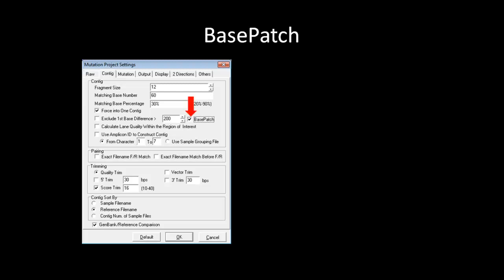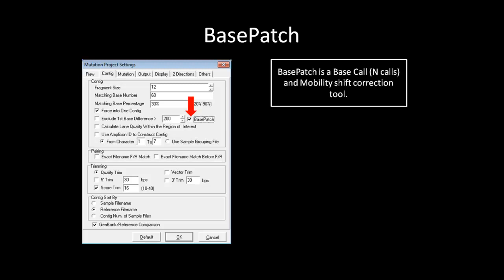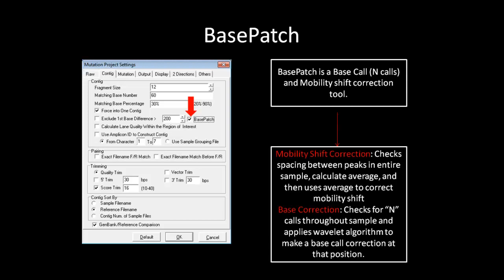The Base Patch option is under the Contig tab of the Process Settings. It is in the Contig tab because Base Patch is a base and mobility correction tool. When activated, Mutation Surveyor will calculate the average spacing for the entire sample and then use the result to correct for the mobility shift error.